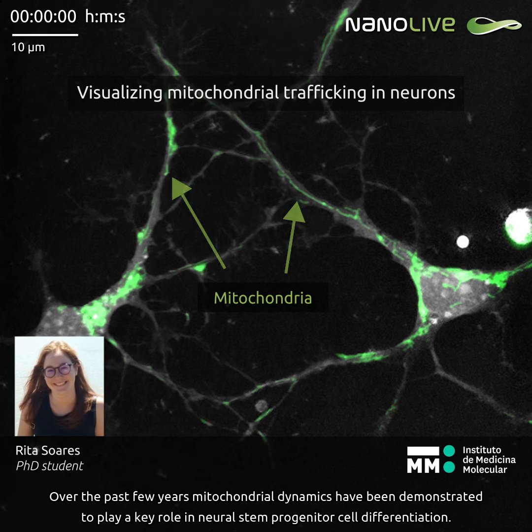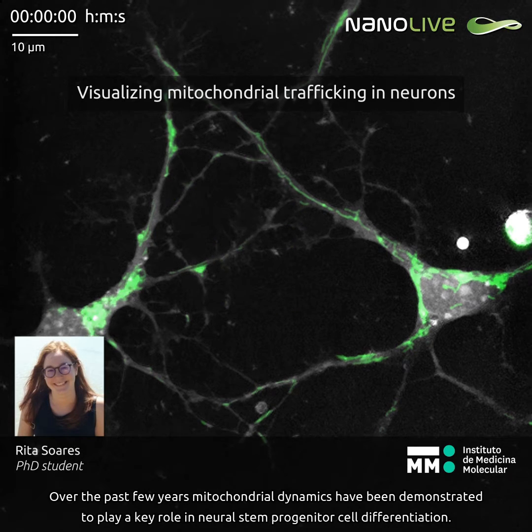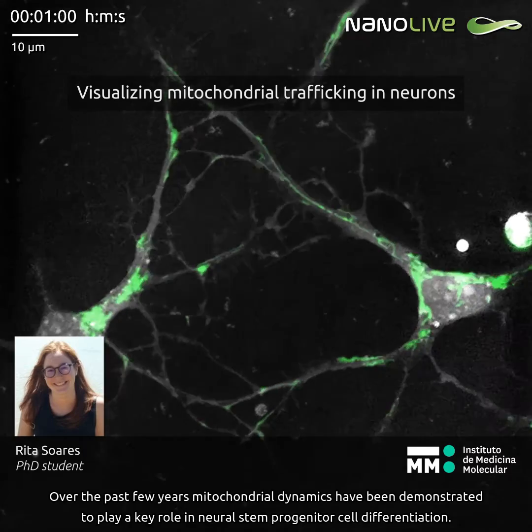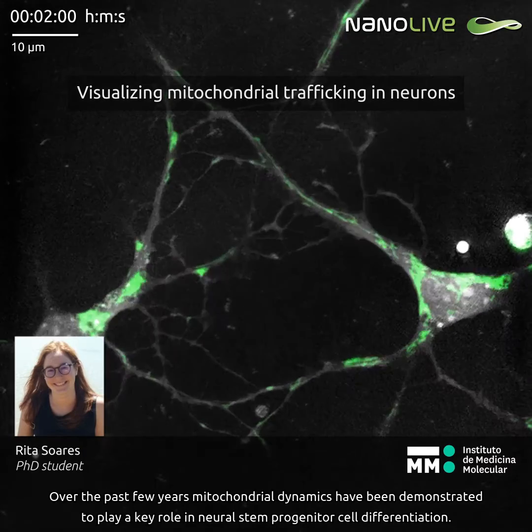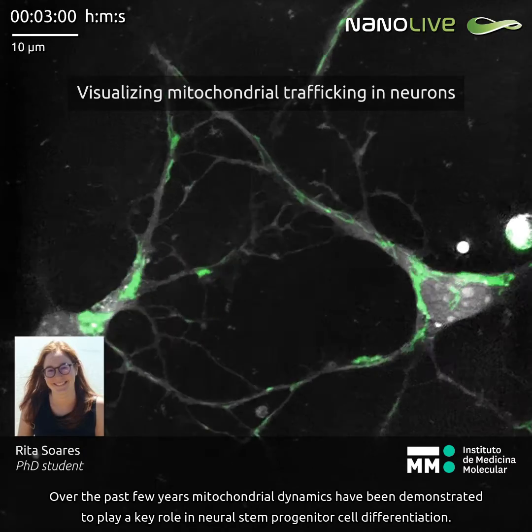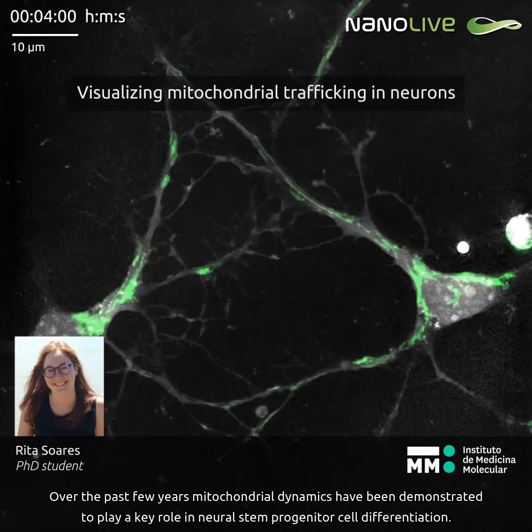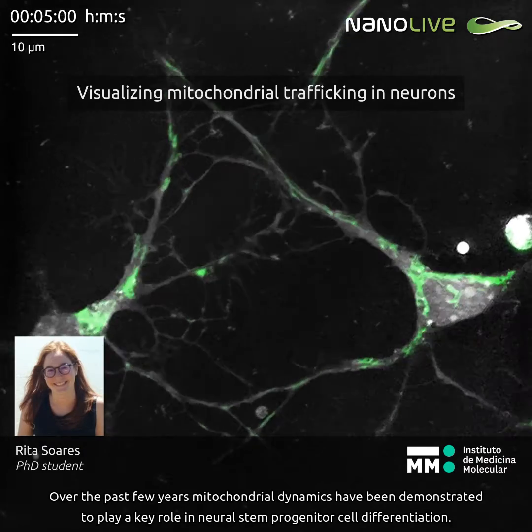Over the past few years, mitochondrial dynamics have been demonstrated to play a key role in neural stem progenitor cell differentiation.